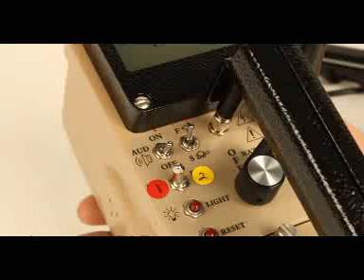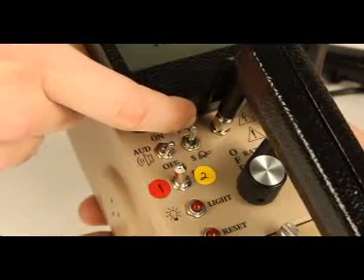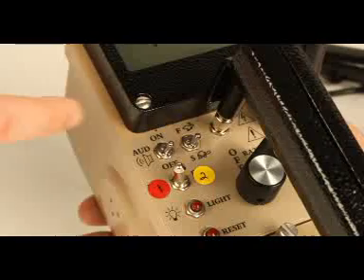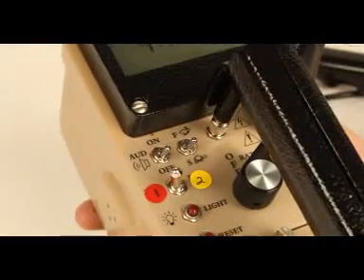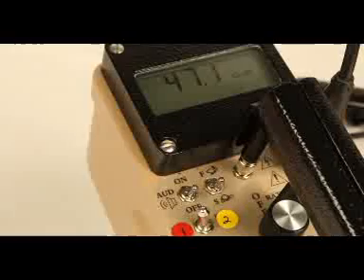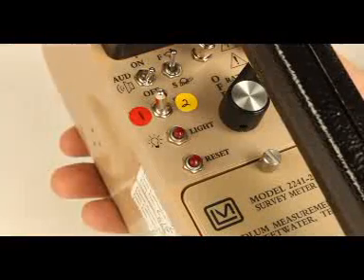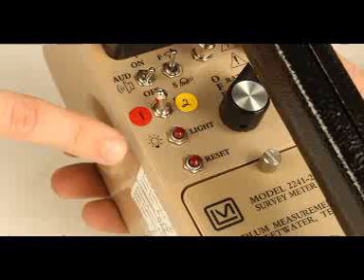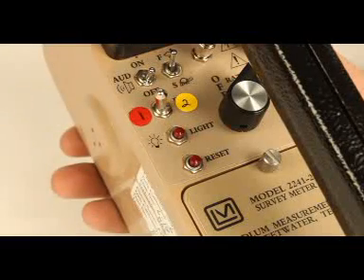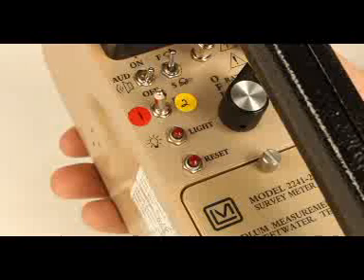A two-position toggle switch selects fast or slow counting response time. The fast setting is used to find radiation, while the slow setting is used to make a radiation measurement, allowing for a more stable display of radiation readings. To utilize the backlight setting, press the light button. This will activate the backlight for anywhere between 5 and 240 seconds depending on the manufacturer's setting.